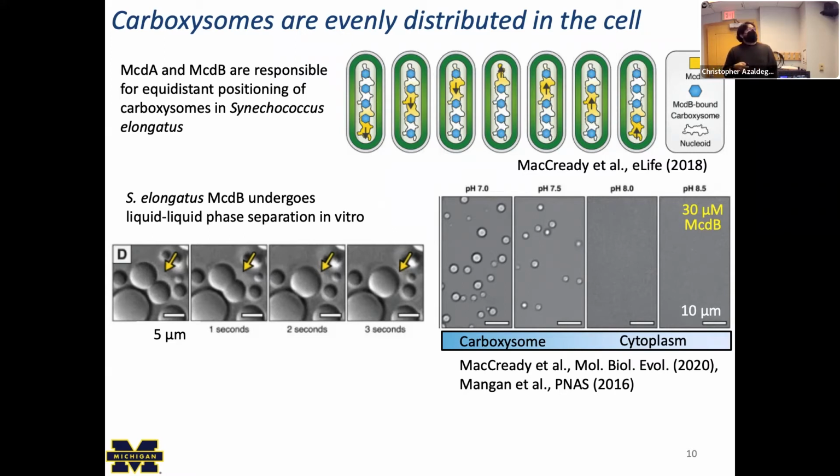And this is interesting because of a proposed model of a pH gradient where the cytoplasm of the cyanobacterial cell is around pH 8, where we would not observe phase transition of mCherry-McdB. However, when you get to the carboxysome internal components, given that the carbonic acid that's present gets converted to CO2, you see a significant decrease of pH, or that's proposed. And so this would correlate well with the conditions where mCherry-McdB will undergo this phase transition, which may point to the phase transition itself having some functional activity in potentially the recognition or the general homeostasis of carboxysomes.